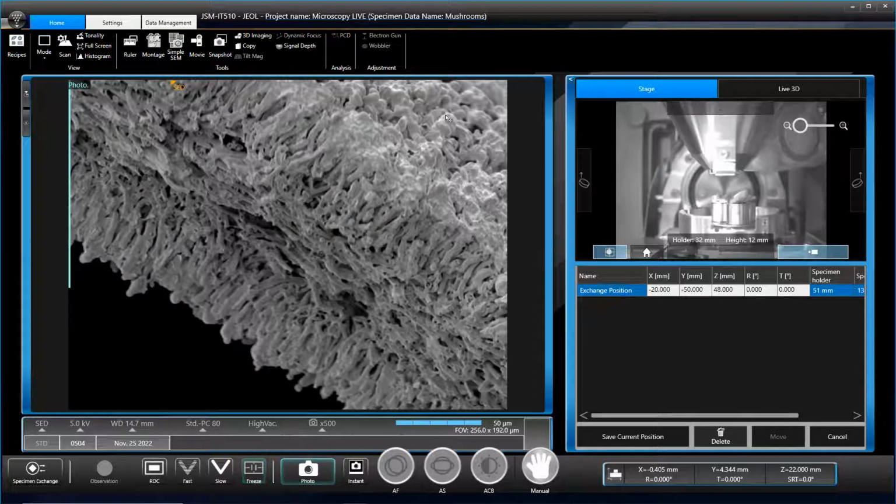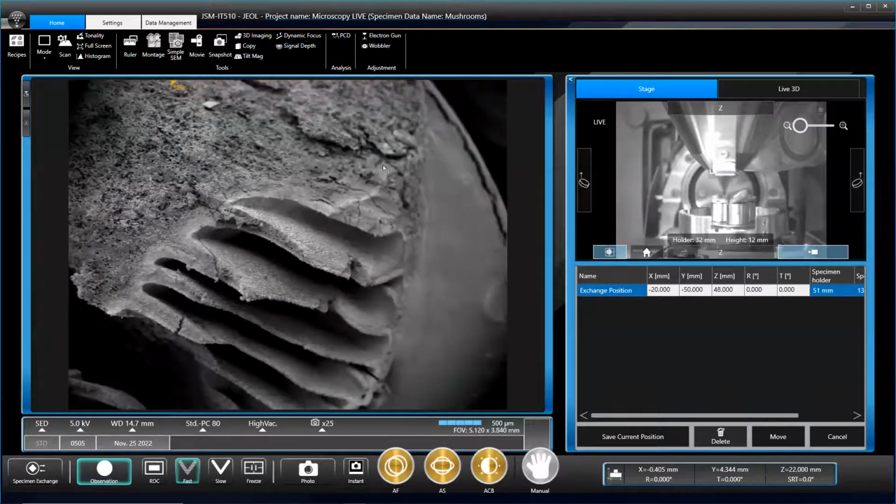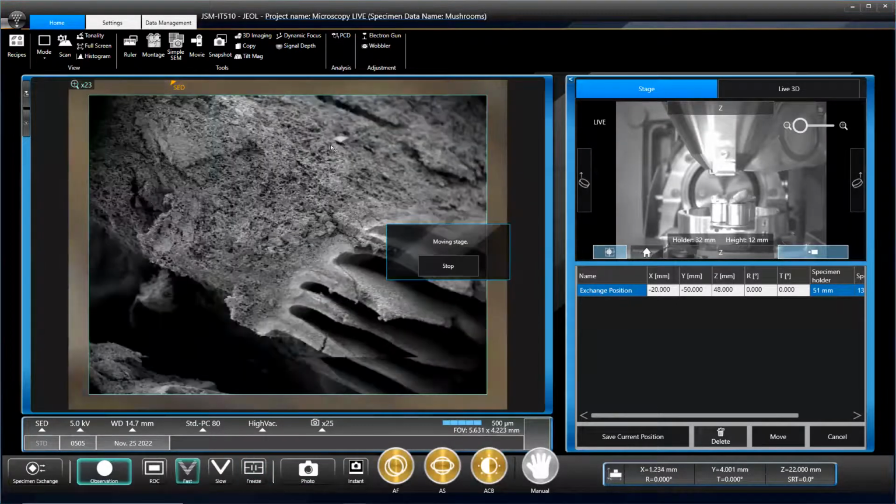Electron microscopy is much more interesting than you think it should be. It's quite surprising, isn't it? Until I met you guys last week, I'd never seen a mushroom this close. Electron microscopy isn't used very often on these. I had a quick search, and there's not many images, especially none of magic mushrooms. So I would love to work with you and get some cool magic mushroom photos. Absolutely, that'd be really cool.